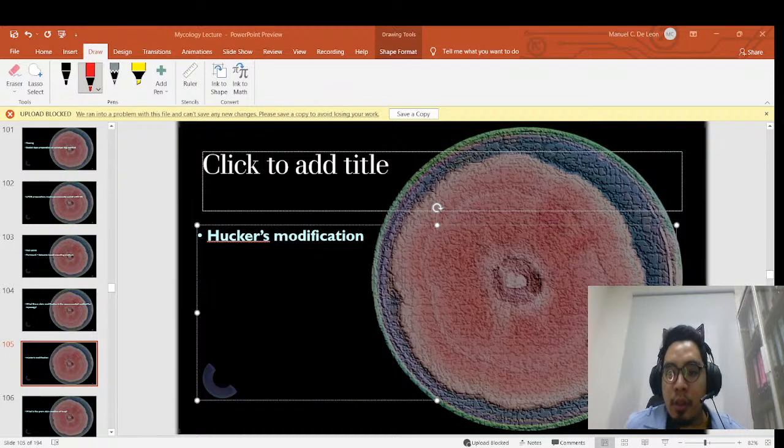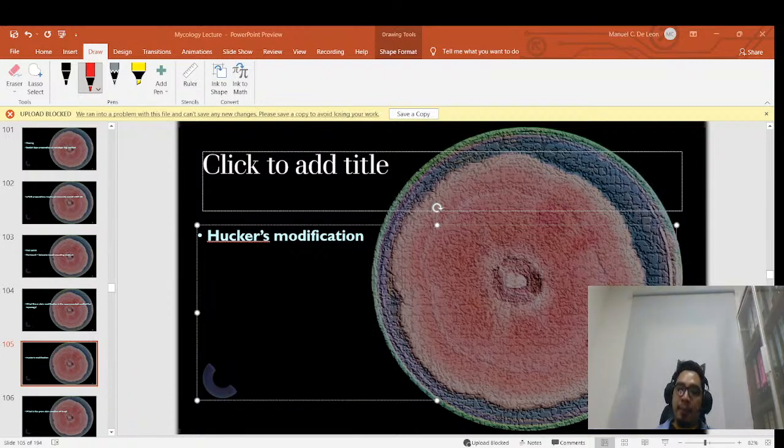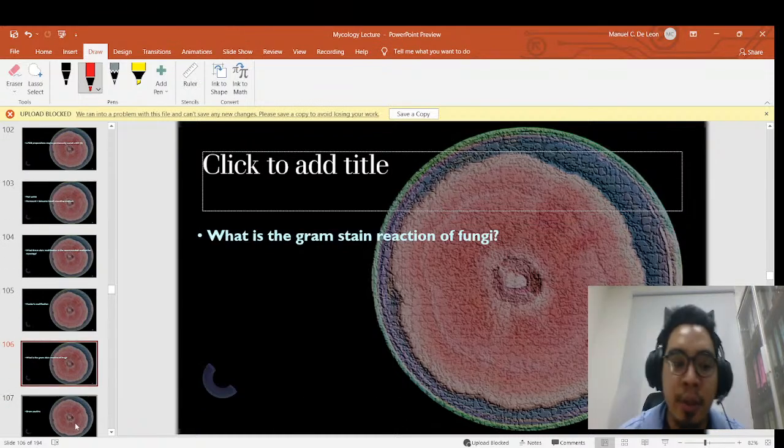Anybody? Iodine. Iodine. All right. Very good. A lot of people are answering the question. So you know one of the most important questions that might be asked in the board exam. So you can at least check off one box. To be specific, it's Gram's iodine. Yes, Adrian was correct. We could use iodine. No problem. And Hucker's modification is basically just modifying the concentration of the mordant.